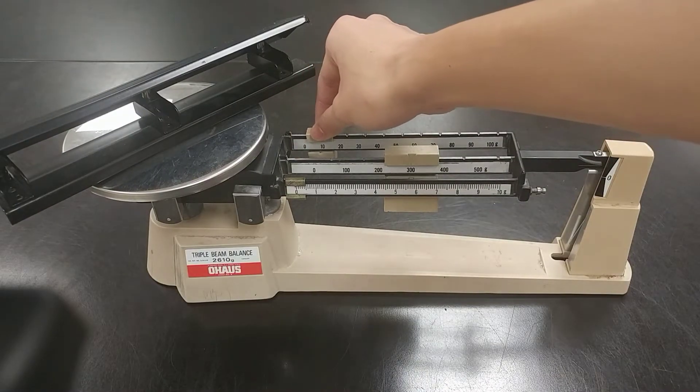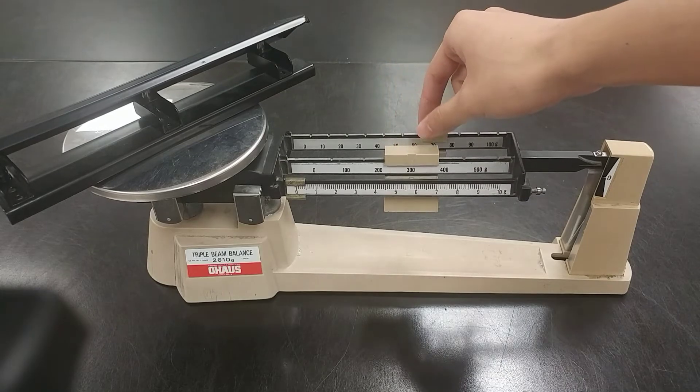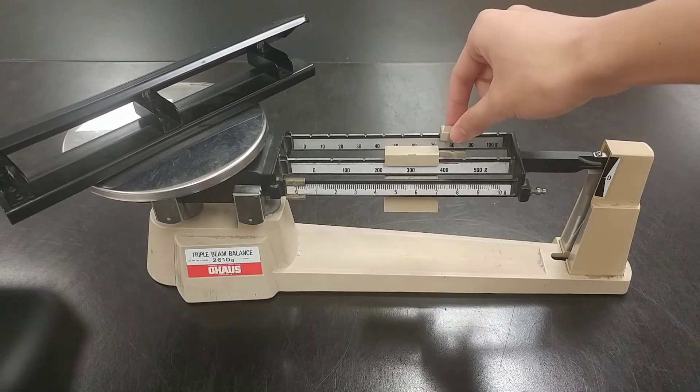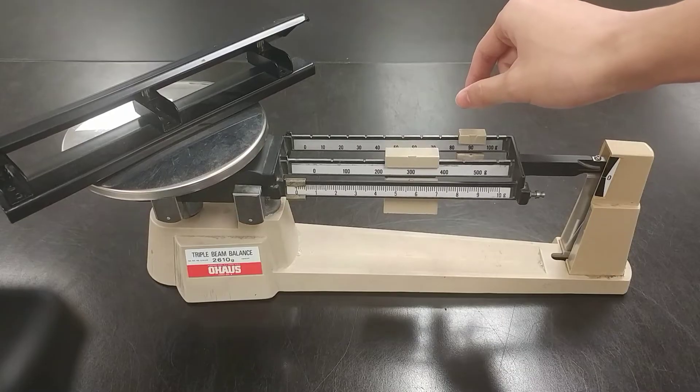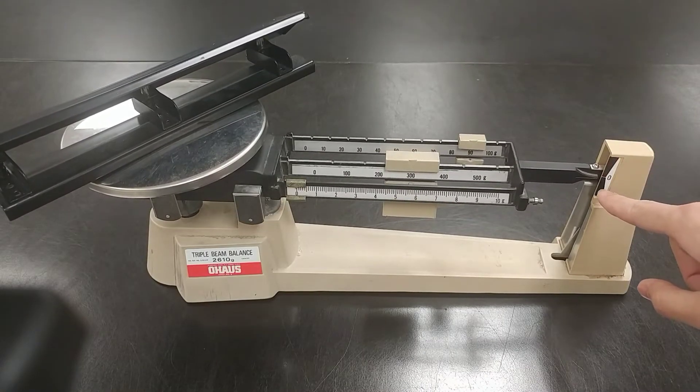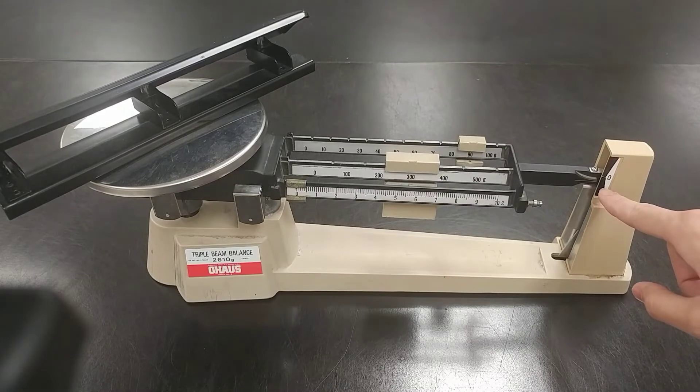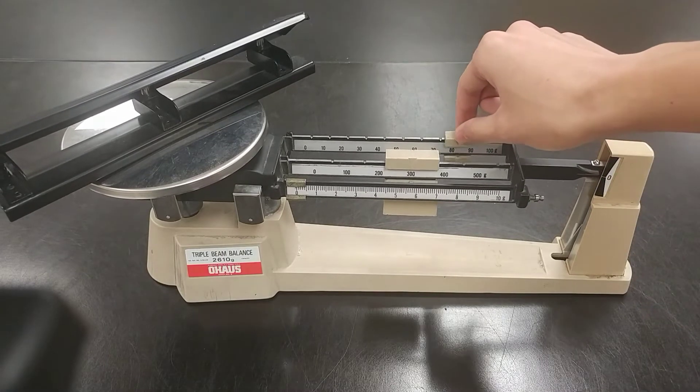Now, go back to the medium one. Moving it: 70, 80, 90. At 90, it goes down. It's too much at 90, so we'll go back to 80.